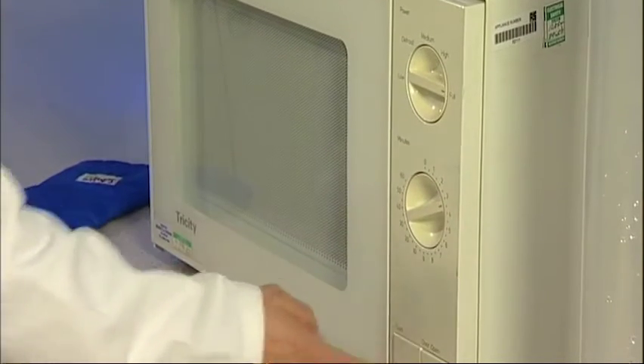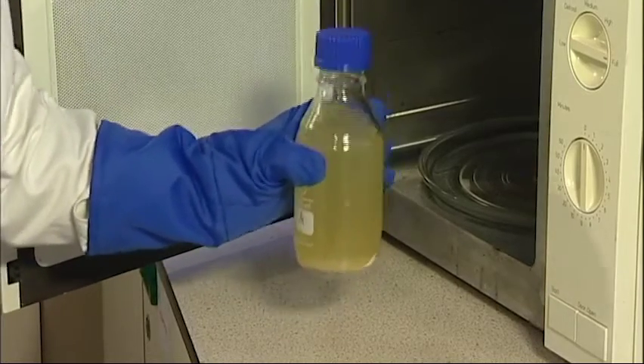Microwave the agar until it dissolves completely. During heating, you can use your heatproof glove to swirl the bottle to help it mix. Bring to the boil three times.